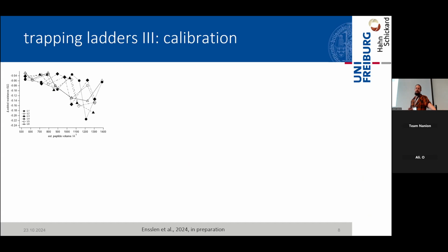And if you then start to group all the cleaving products you have here according to the identity of the amino acids, I found something like this, which already shows, okay, the red dots correspond to arginines. They are all somewhere down here. Small serines are all up there, and the alanines are here. And when we then did some homoarginine ladder measurements, this is the red line which is there, it really fell in the same area as all the hetero-peptide events did. So this was something which I found very nice.